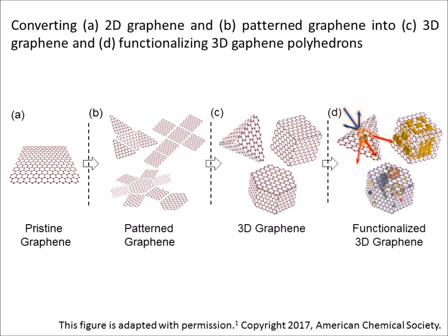In this regard, integrating 2D graphene into the structures of functionalized, well-defined, three-dimensional polyhedrons has been of great interest recently in the graphene community. 3D graphene polyhedrons may be beneficial for many applications. Examples include gas and water protected containers, molecular storage, delivery systems, encapsulation of liquid-based materials, for in situ observation in electron microscopy, functional optoelectronic devices, and metamaterials.